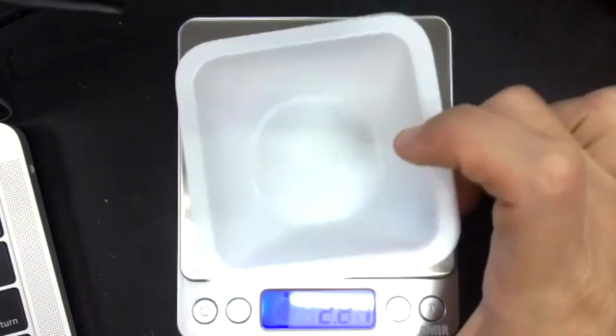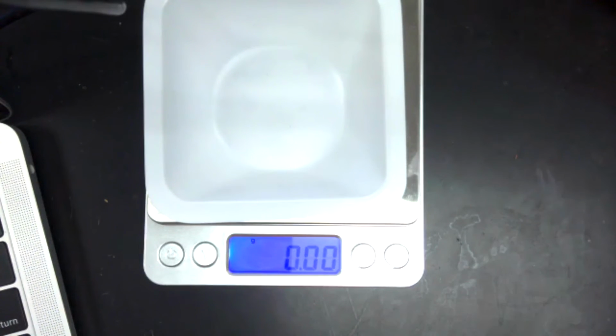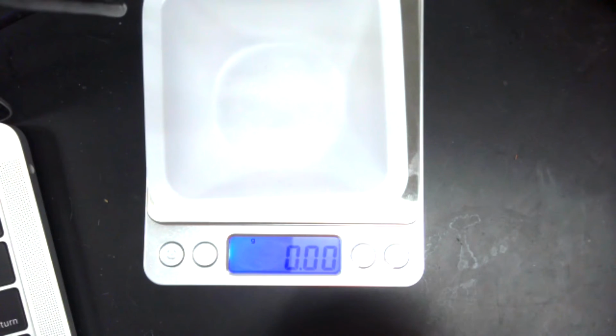All right, tare out the weight of your boat and then get your core and write that in the table that I'm going to show you in a minute here. Then do your other core and write those in the table. And then you're going to pour your sucrose on there. So this is my 0.2 molar.